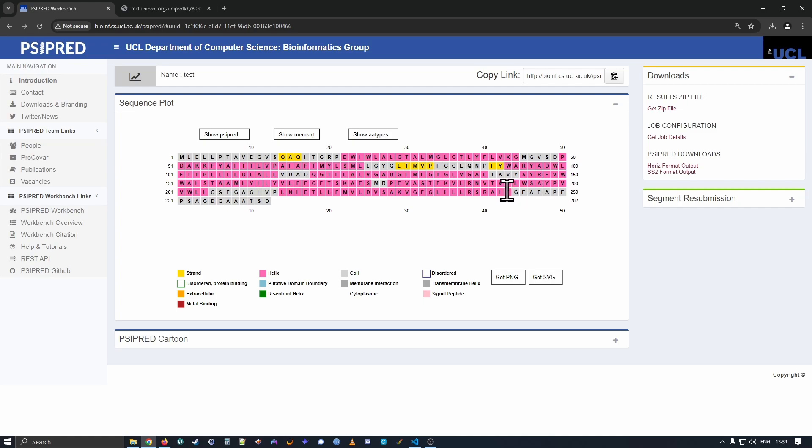Next, and really importantly, we have the sequence plot. So for all of our sequence methods, we show you the sequence that you submitted and it will be annotated with any of the sequence features that our predictors have identified.